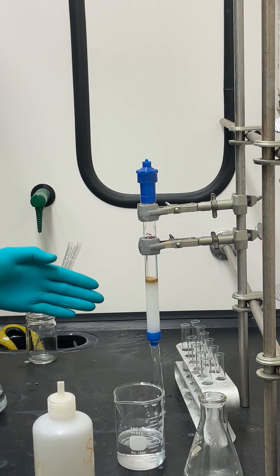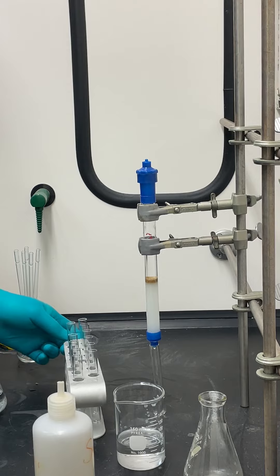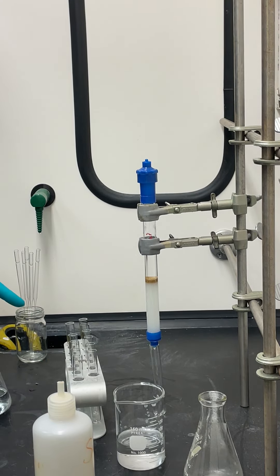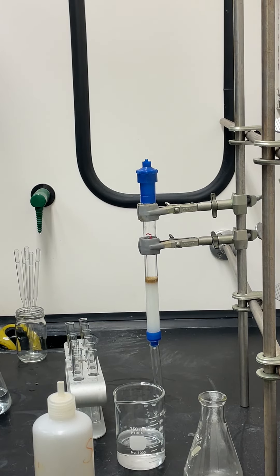Once you've collected all your fractions, you need to determine which ones have the product. Go back to TLC — take all these test tubes, draw a line on a TLC plate, put six little ticks on it, and TLC every other test tube to get a proxy idea of where your product is. These test tube racks hold 12 test tubes. If you see product in test tubes two and four but not in six, your second TLC would be tubes one, two, three, four, and five to narrow it down precisely.